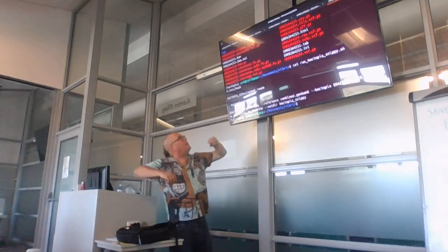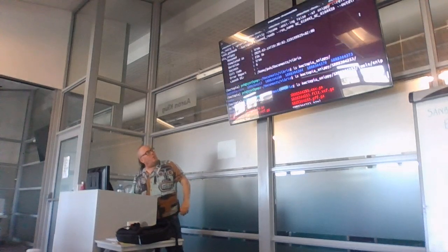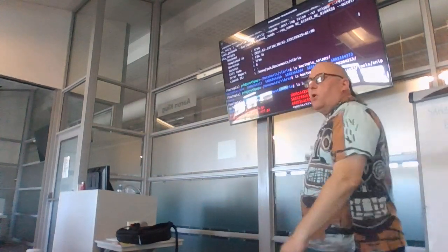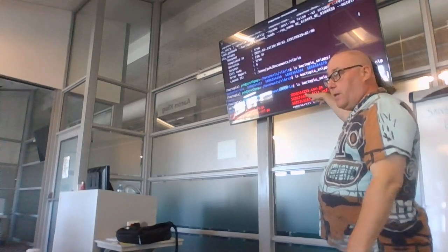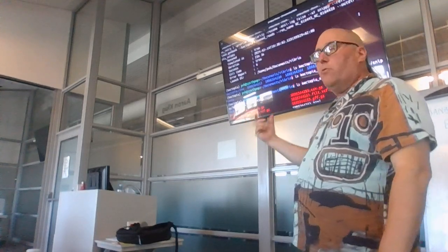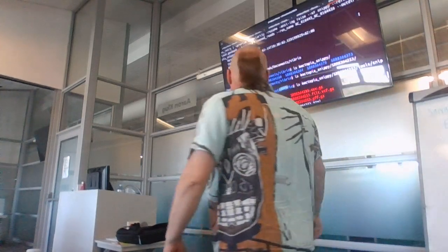And the reason for that is because you can obviously use Snippy to align against different reference sequences, okay? So if you don't set run name, it will just call that folder Snippy. So then you'll get a Snippy/Snippy folder. But I like giving it a meaningful name so that I can remember which reference I used for this run, okay?